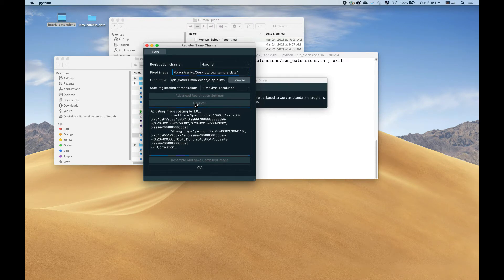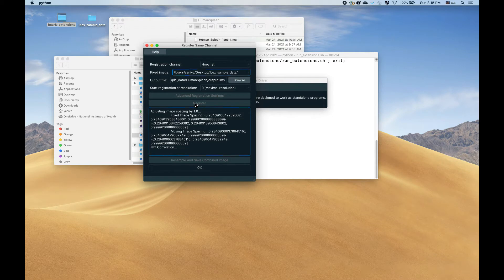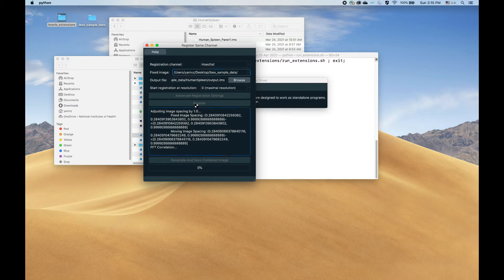Now, the thing with the registration is that it does take some time, so in standard use, this is about the right point to go get a cup of coffee. For this demo, I will just speed the video along.